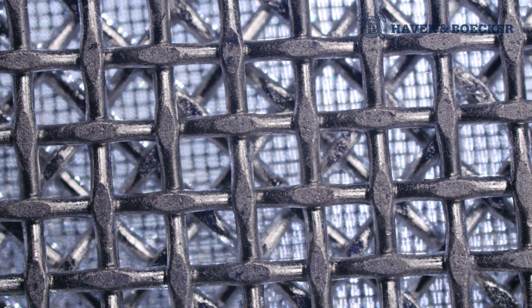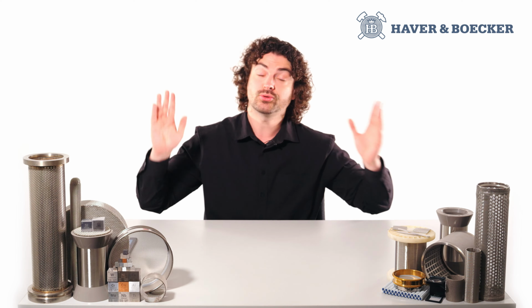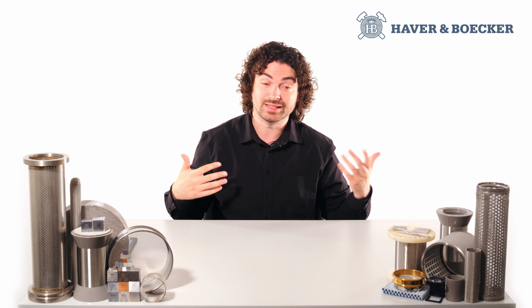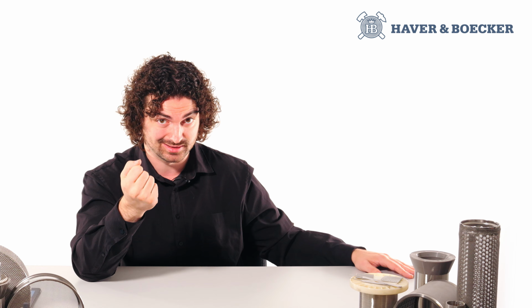Preventing this requires a support structure providing uniform flow resistance across its entire surface. Structural failure also leads to the migration and loss of stationary phase media. If pore openings exceed the size of the smallest resin beads, particles bleed through the support layer, lowering bed height and creating permanent voids. Escaping particles travel downstream, risking contamination to delicate detectors, valves, and final products.